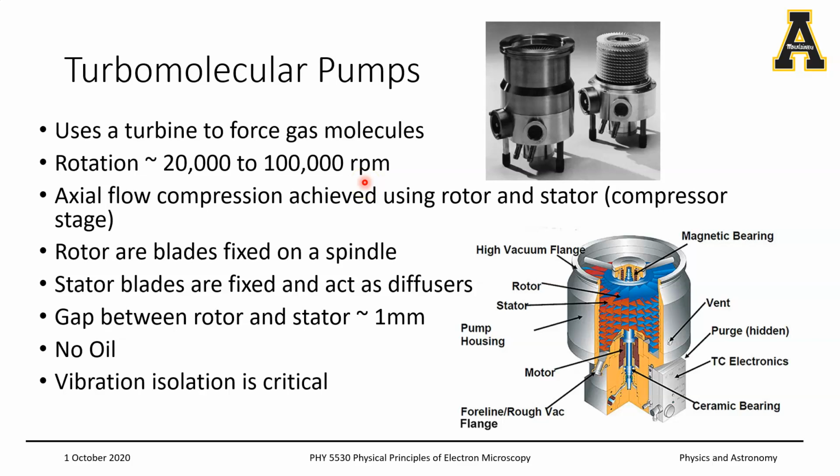And if you haven't seen a turbo pump in the past, in a lab or research setting, you've definitely seen one on an aircraft. Those are the turbojet engines, the turbines that are connected to the wings of any aircraft to generate that kind of suction. So essentially, what happens is you have these extremely high speed rotor blades that rotate. So those are called the rotors, and then you have stators.